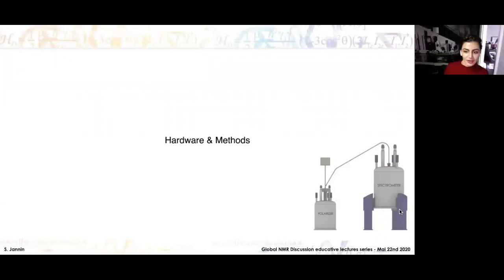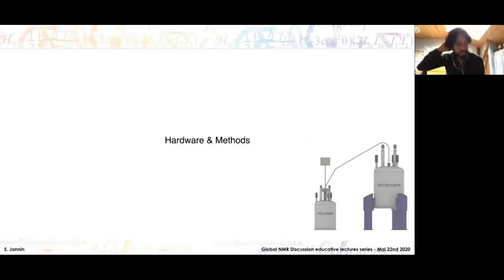And the next question is, how much time currently is needed to reach the NMR spectrometer? So yeah, we'll talk about that. If you do it manually and you inject it manually in a human, for example, it can take up to a minute. And if you do it with an automatic system with fast valves and fast pumps, then it can take around a second, 1 or 2 seconds, typically.